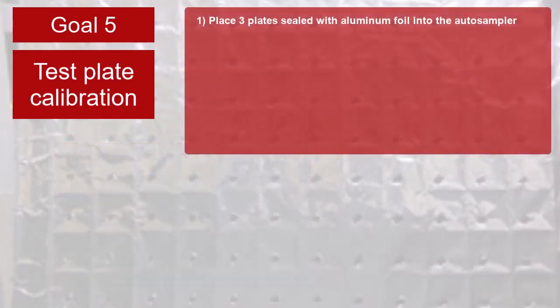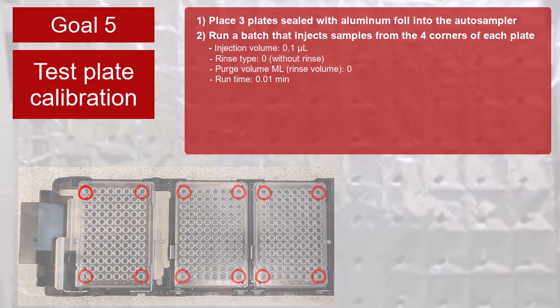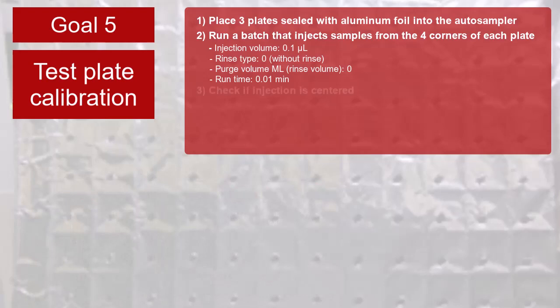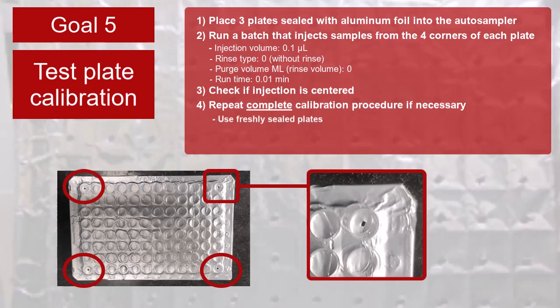Place plates that are sealed with aluminum foil into the auto-sampler. In the acquisition software, create and run a batch that injects samples from the four corners of the front, middle, and back plates using the recommended parameters. After the batch completes, check the position of each injection on all plates. This is what it should look like. If any positions require adjustment, repeat the complete calibration procedure. Run another batch using freshly sealed plates to confirm the positions are now correct.